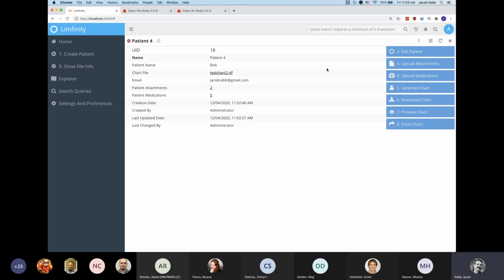All right. Well, now we can move on to something that's kind of like the opposite of the example we just looked at. What this tool will do is take data in the database, specifically the medications, and generate a file from them, and it will save that file to the chart file UDF.